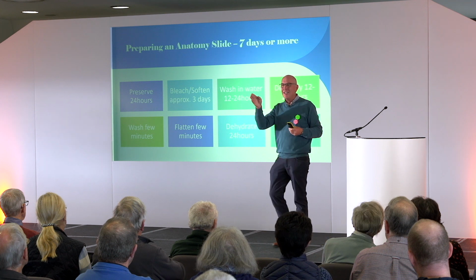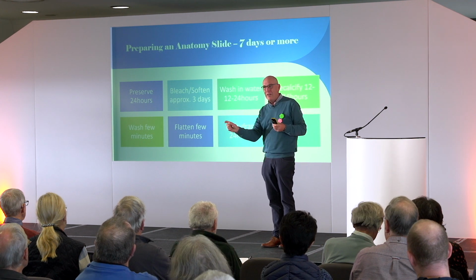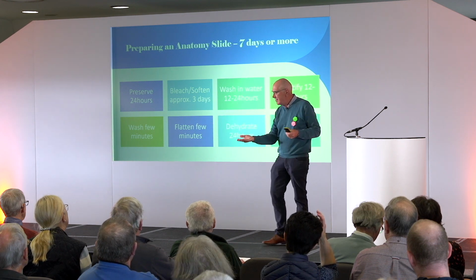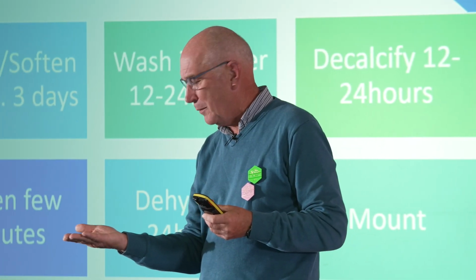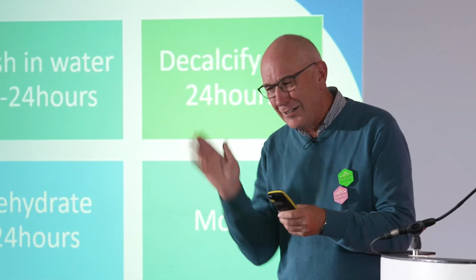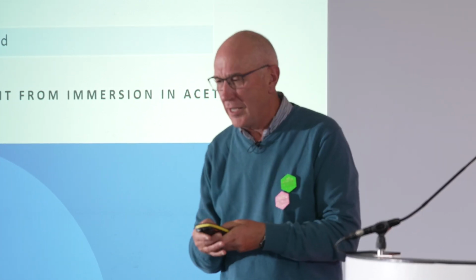You've gone through the 7 days, and you then put them into new mount at the end, and that takes several days to set, and you put it into a warming cupboard so it sets, and lo and behold, the whole thing's full of air bubbles, and you have to go back to the beginning and start again. It's frustrating. So just accept air bubbles, that's all I say.